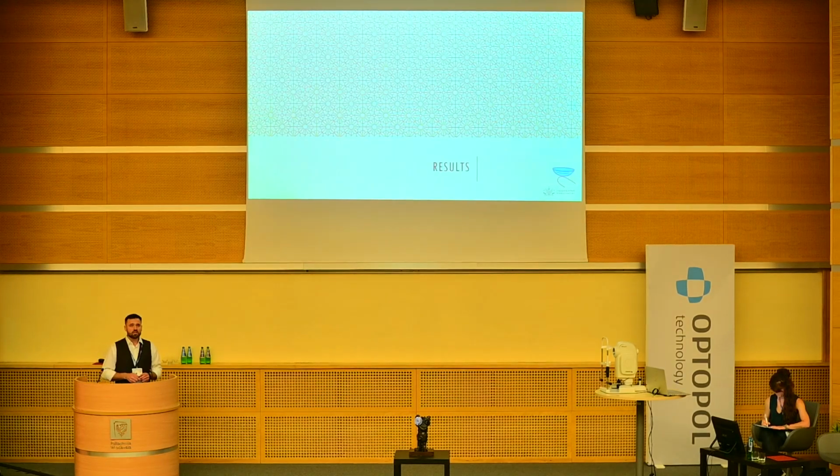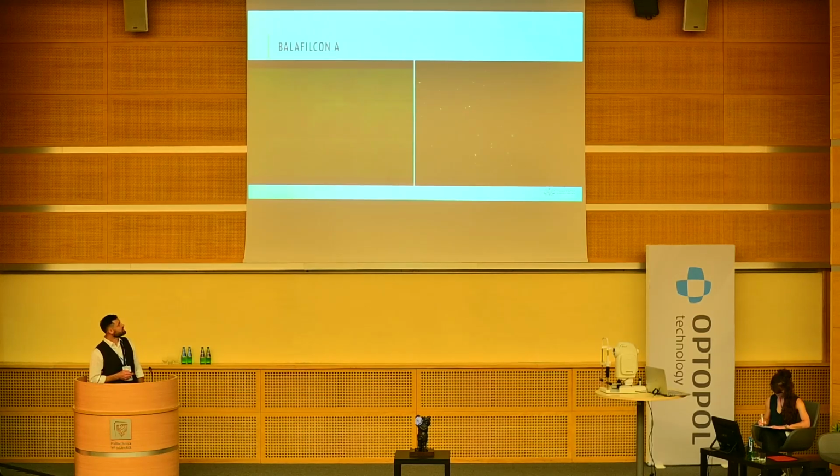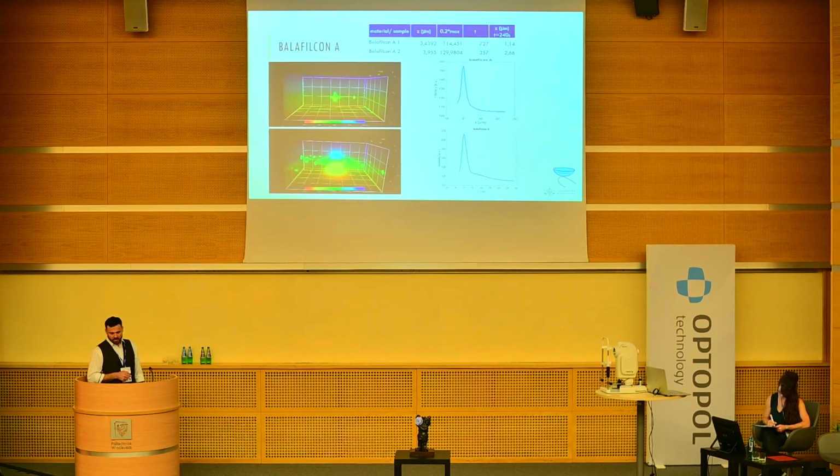So a little about the results. The very first slide that I will show you next is the videos from the two samples of one material, and you will see that they are kind of different, because as I said, we cannot control the amount of the lipids. So here we have much more, and here we have less, but after 10 minutes in both lenses we see deposits. So as I said, we choose the biggest deposits, and then we've done the visualization and some kind of calculation. Why we've done calculation?